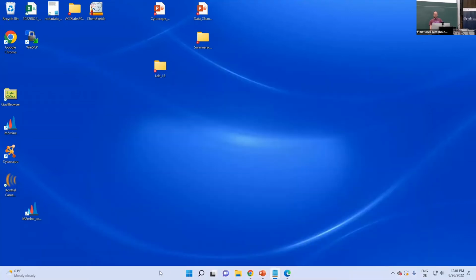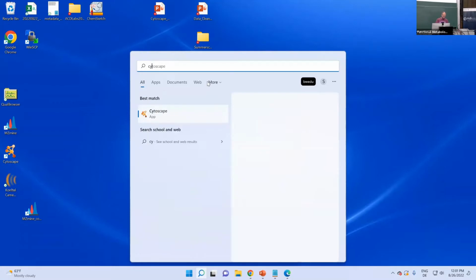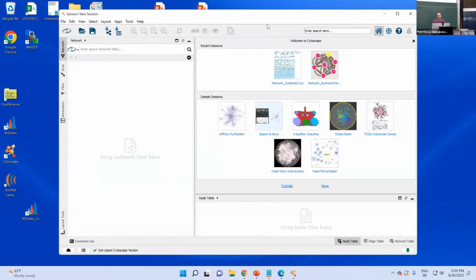Let's go back to Cytoscape, and let's open some of the results here. So you still have the network saved from the other day. And if you did not change any feature finding settings and rerun your feature finding job, then you should be able to just proceed with that old network, right?